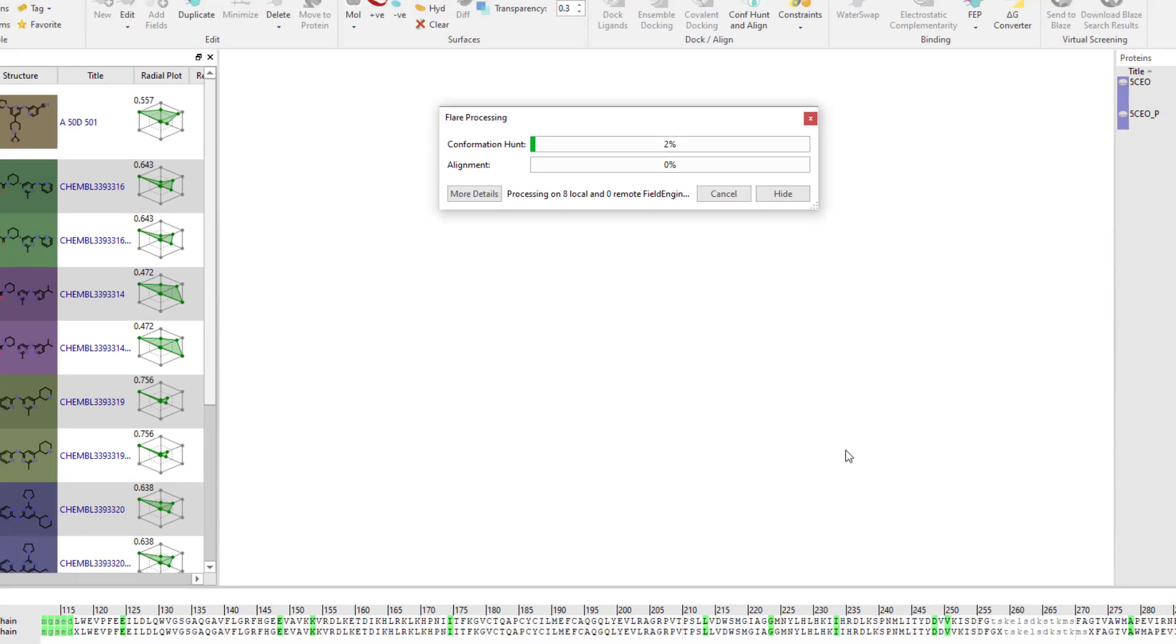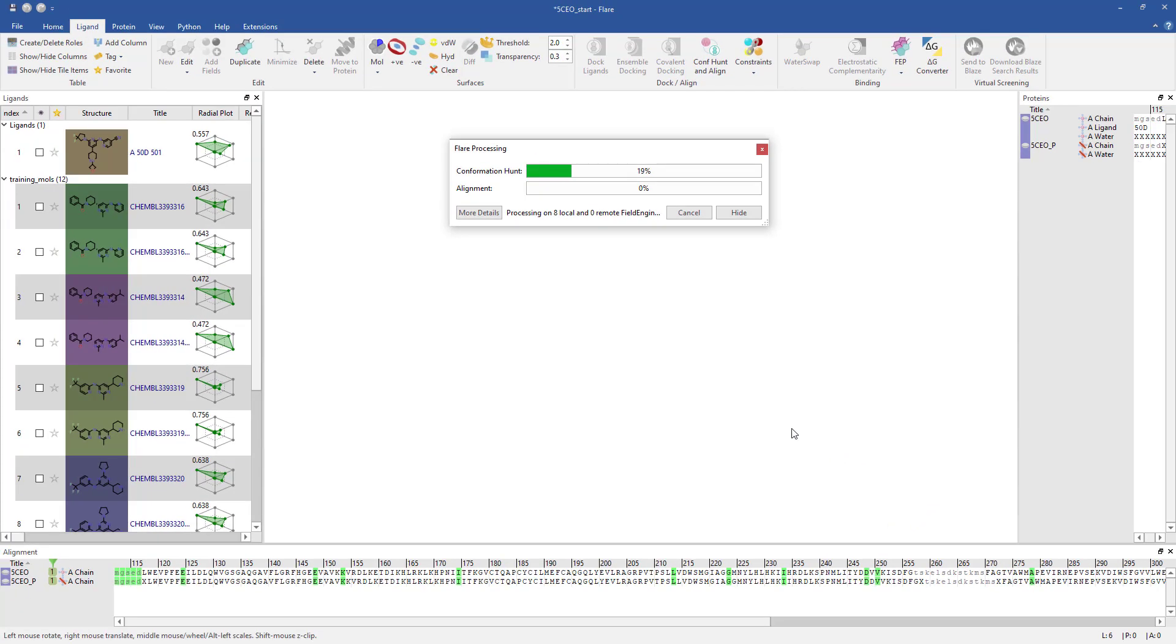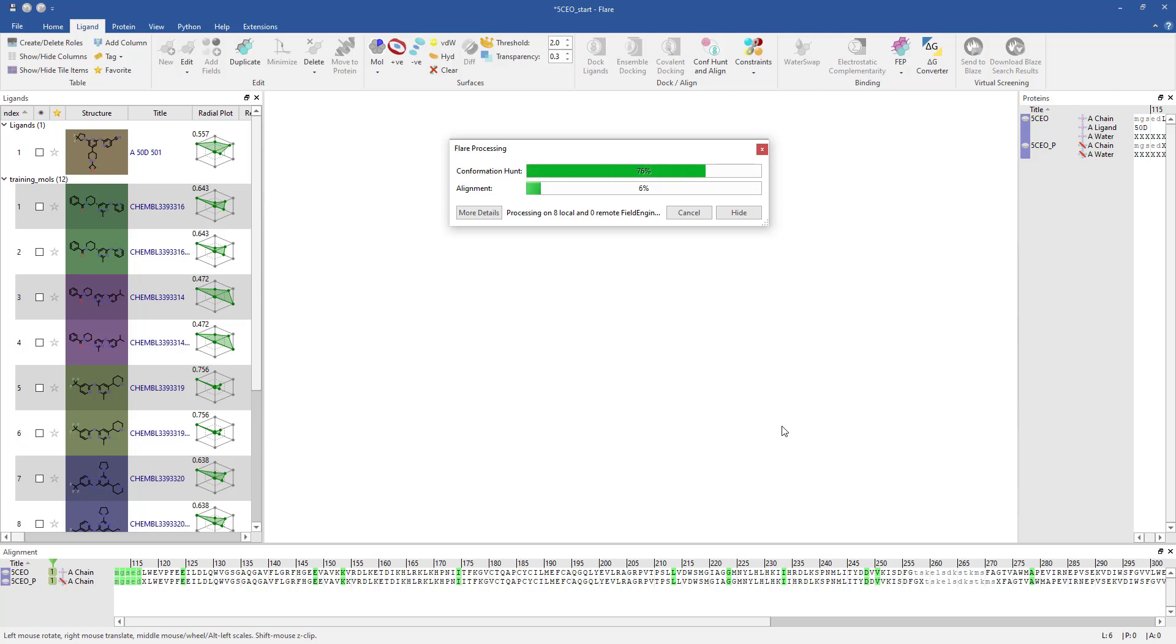The alignment experiment contains two steps. Firstly, the comparison molecules must be confirmationally populated. Next, each confirmation is aligned to the reference molecule using 3D field point patterns. Each alignment is scored using 50% field similarity and 50% shape similarity.